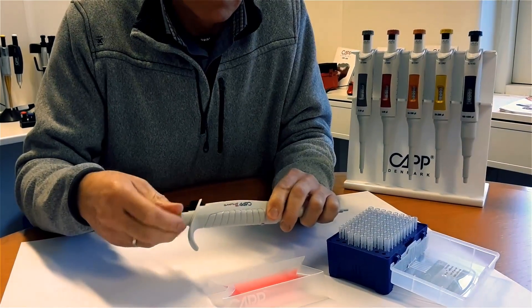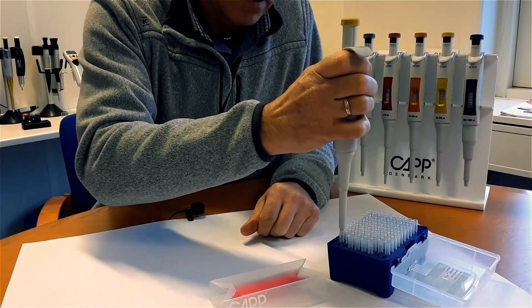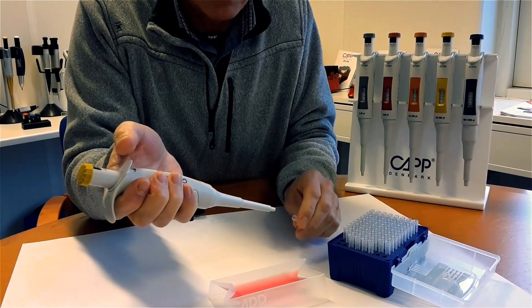Set the pipette back to maximum volume. Mount the pipette tip and press the tip ejector. Observe that the tip ejector is functioning smoothly.